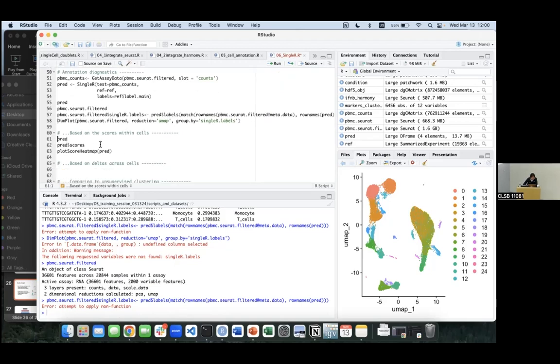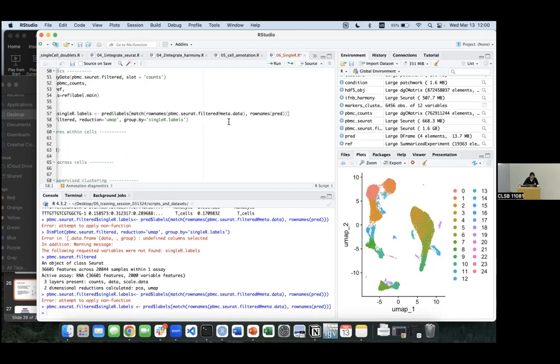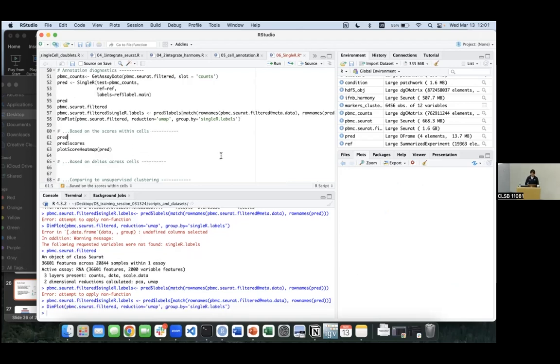I'll try to have this explained at the end of the workshop, but it's there. Okay. Oh, is it a round parenthesis? Yeah, that's the problem. Yeah, it's always the stupid bugs that keep you stopped in the middle of your coding.